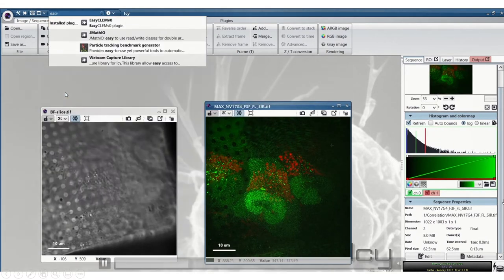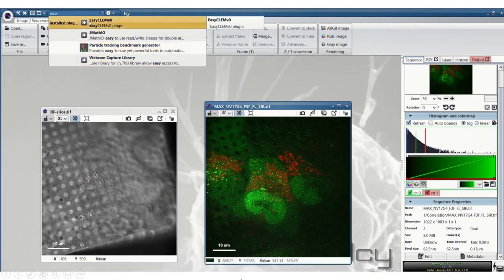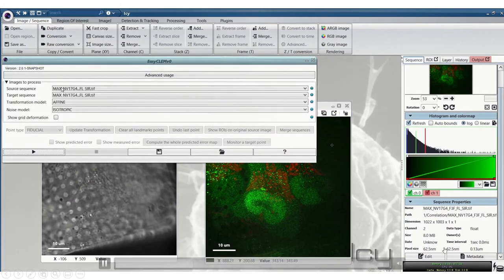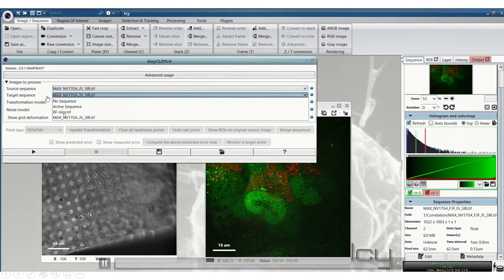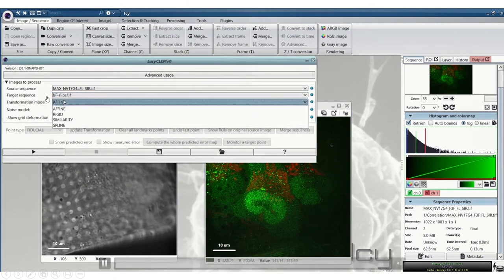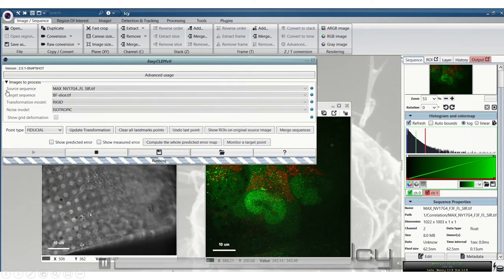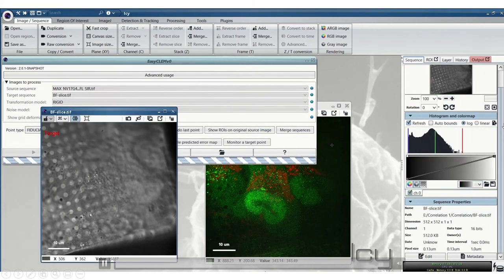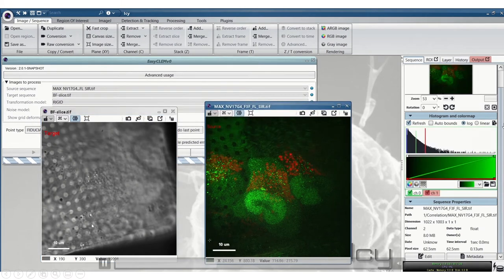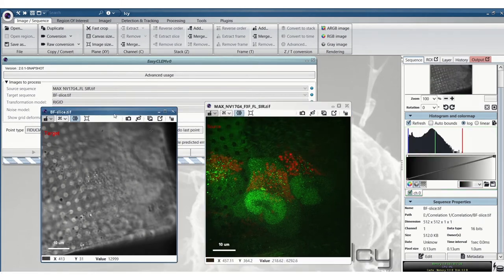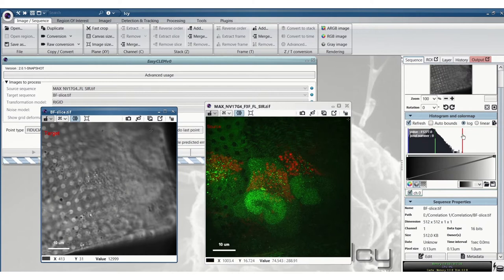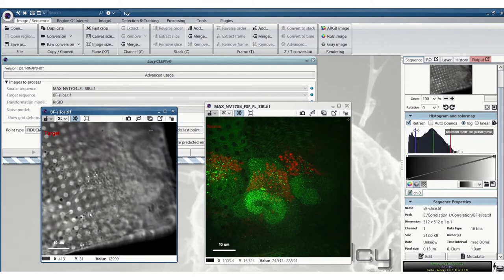It's also important to check the pixel size down here. Here we're setting the source as the SIM image and the target as the brightfield. So the source is the one that's going to move. Then we'll press play and we'll place fiducial markers on any of the images.